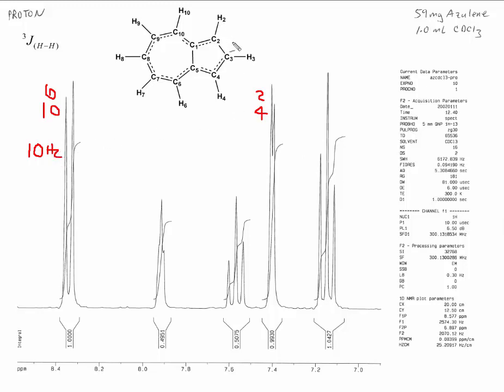And if you compared the splitting, the 10 hertz refers to the 6 and the 7, the thing that's splitting the 6, or the 9 and the 10, that would be equivalent. I'm saying that would be 10 hertz. And if you looked at the 4 and the 3, that splitting is about, let me look it up here quick, that's about 4 hertz.